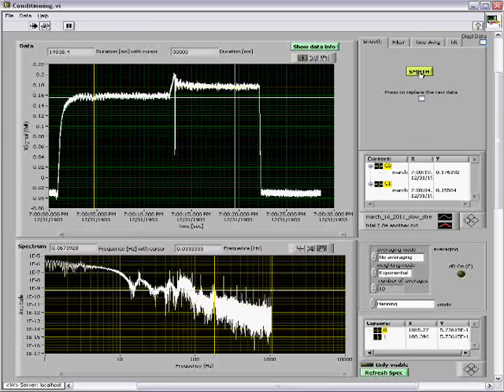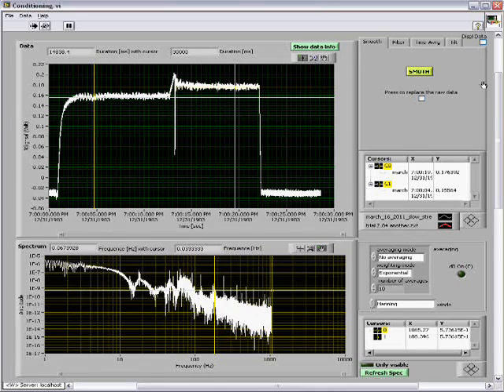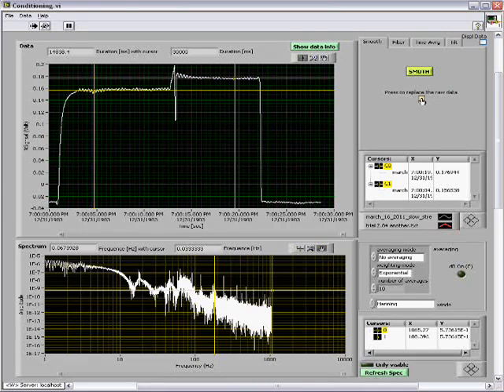So let's do a smoothing first. I just click this button. It's a preset function. So this is the data that was conditioned by smooth. And now the raw data is still in memory, and you have displayed this processed or conditioned data. If you want to display the raw data, you click the display data button and you can smooth it again. If you press this button here, this smoothened data will replace the raw data. So if I click on this button again, there is no more raw data because it was replaced with the conditioned data.